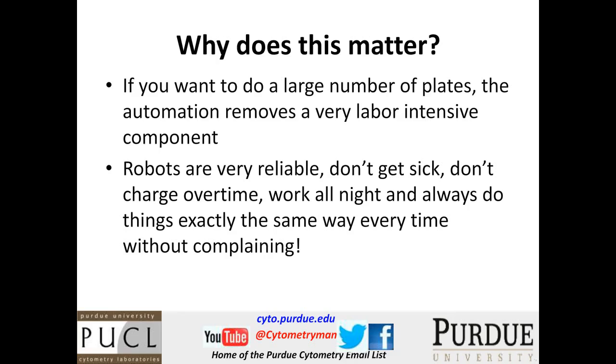Running plates, I've found over the last several years that I've been running a lot of microtiter plates on flow cytometers and preparing a lot of plates using automated preparation systems, that there is a reduction in error. So robots do exactly what you tell them to do. They are extremely reliable. They don't get sick. They don't charge overtime. They'll work all night if you want them to, and they repeat things with precision.